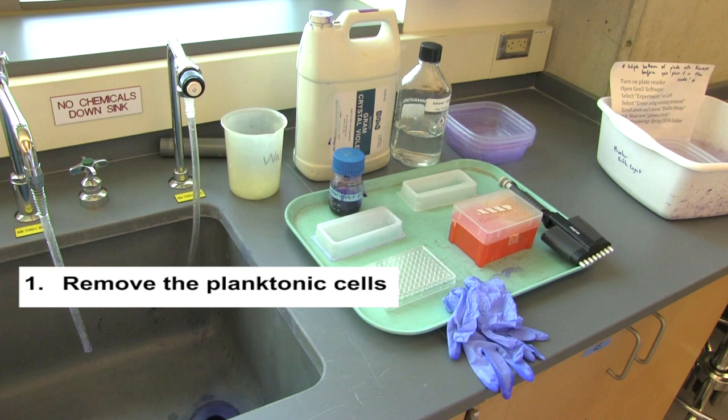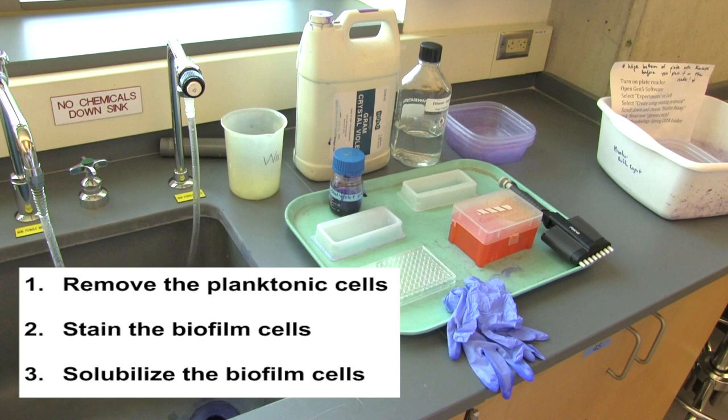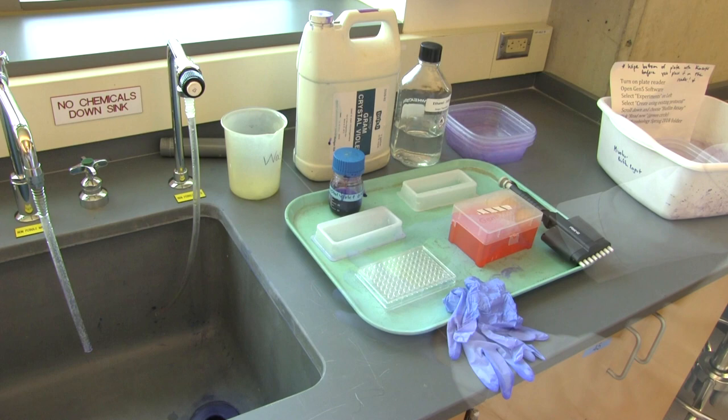First, removing the planktonic cells. These are the cells that are not a part of the biofilm. Second, staining the cells that remain in the biofilm. Third, solubilizing the cells so that we can accurately quantify the number of cells in each biofilm.